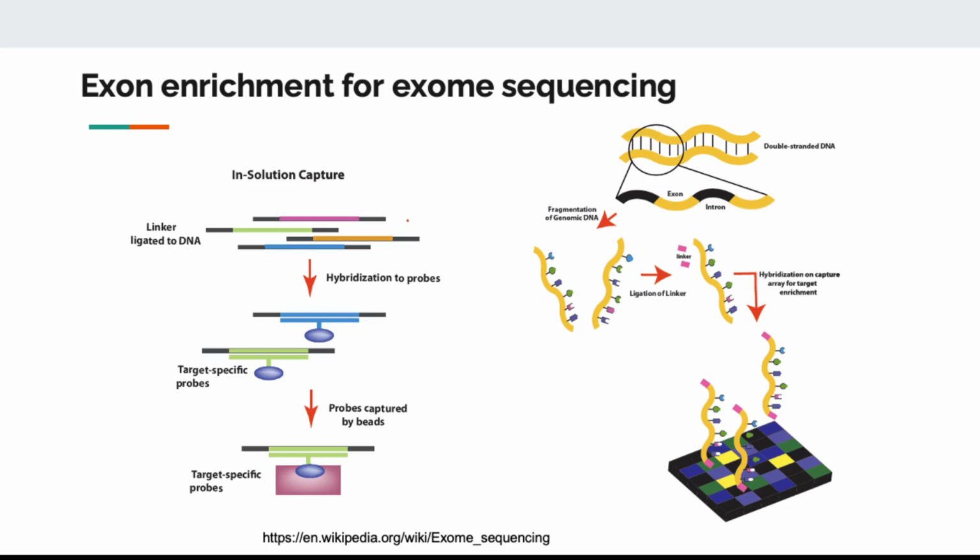So at this point, you might be curious, how can we do whole genome sequencing? Because for the whole genome, we don't have any pattern. How can we amplify the whole genome? The idea is, instead of making a probe that is specific for the exon or for the gene, for whole genome sequencing we generate random primers. So we generate almost all possibilities of nucleotides. Whichever region of the chromosome, there's going to be a probe that is very similar to it. So we can amplify the whole genome.